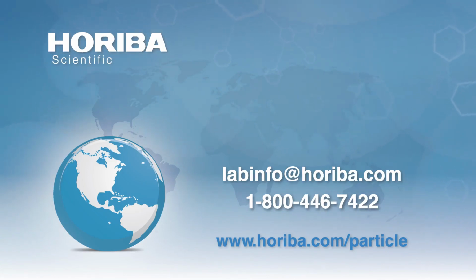But what you should be doing with the solvent system, whatever you're using, is something like a Karl Fischer titration to find out how much water is there. Because even if you start with a known surface of titanium, you put it in a solvent that you buy a different batch of, or from different manufacturers, it might have different amounts of water in there.